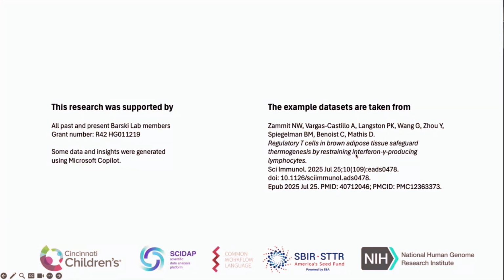Well, most probably I would just build the PCA to see how the samples are grouped, and whether there are any samples that are far away from all of the other groups. I didn't have this situation with this particular data set. I had a similar situation running DiffBind, which internally runs DESeq. For that, I had to remove some of the samples, and then the results looked much better.